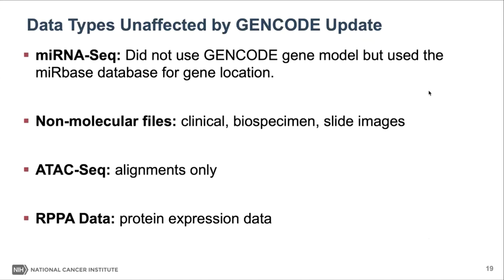Non-molecular files, it's basically common sense, but clinical biospecimen slide images, because they don't require anything with the gene model, remain unchanged. The ATAC-seq data, that was only alignments and was also unaffected by this change. And then the RPPA data, the protein expression data, was also unaffected.